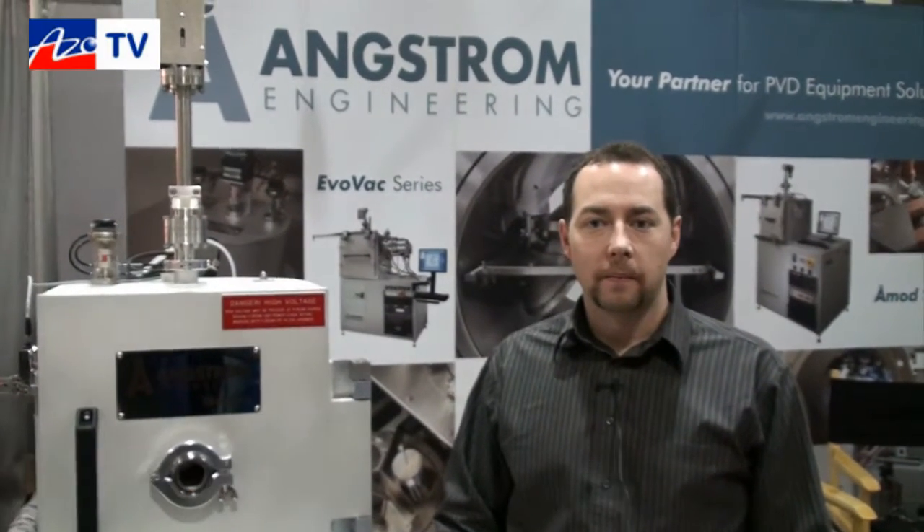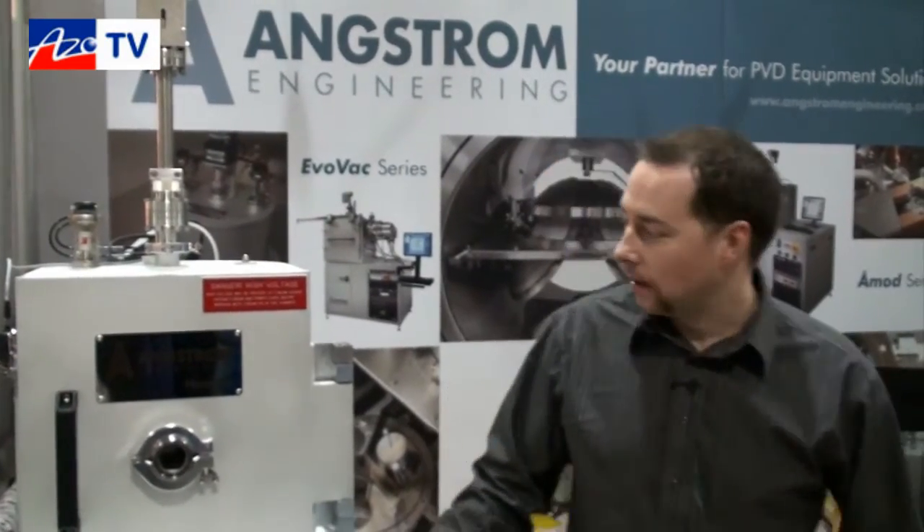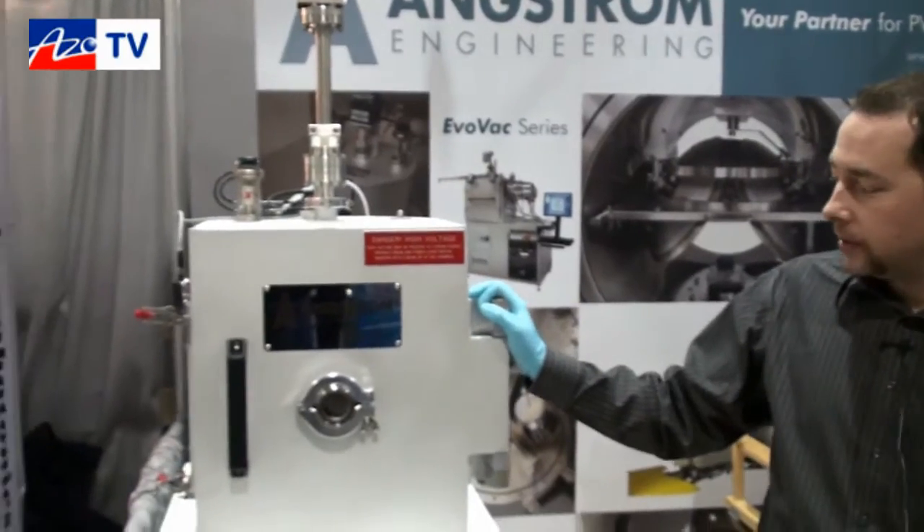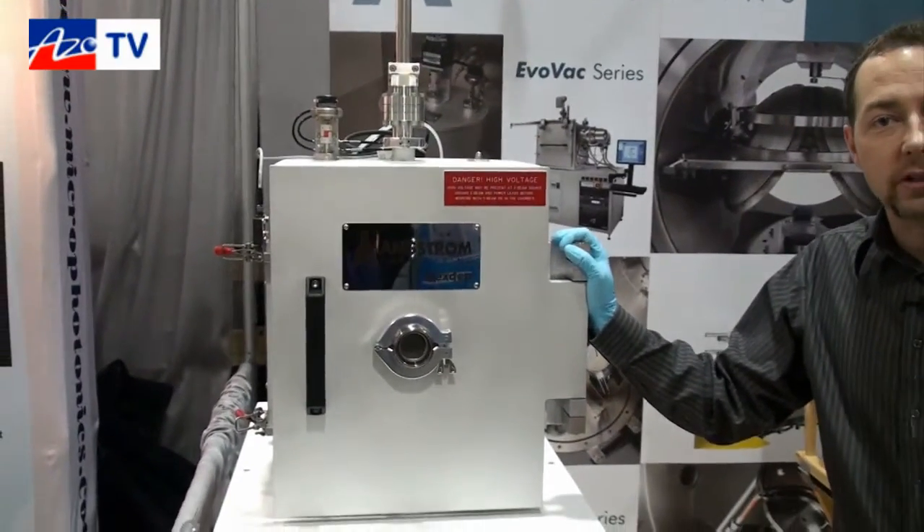This is Cameron Chai bringing another episode of AzoTV, and today I'm speaking to Andrew Campbell from Angstrom Engineering. He's going to tell us about their Next Step electron beam evaporation system. Thank you very much. This is our Next Step evaporation system — it's an R&D coater for universities and labs.